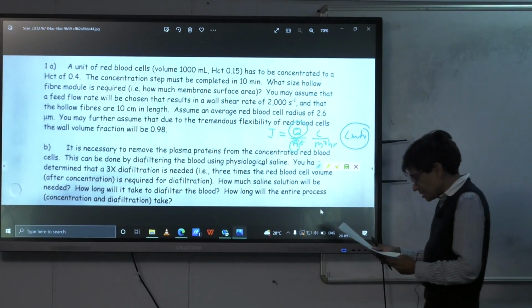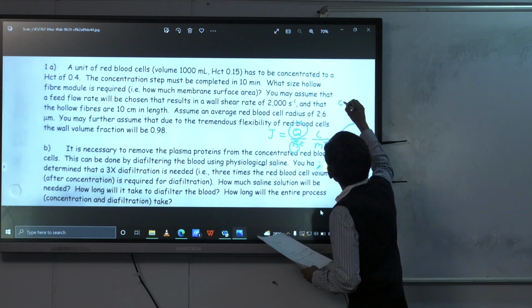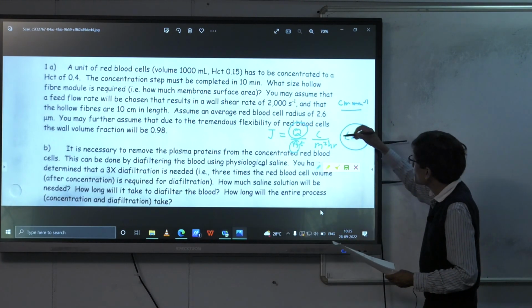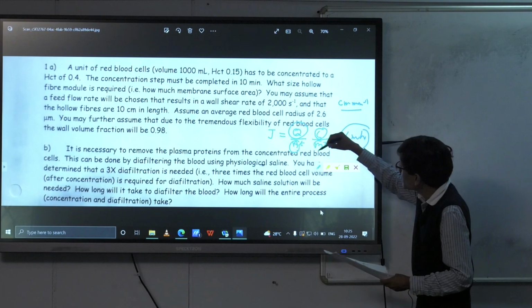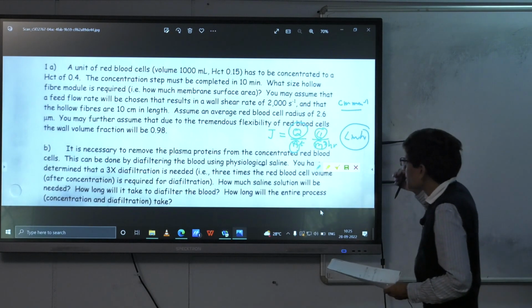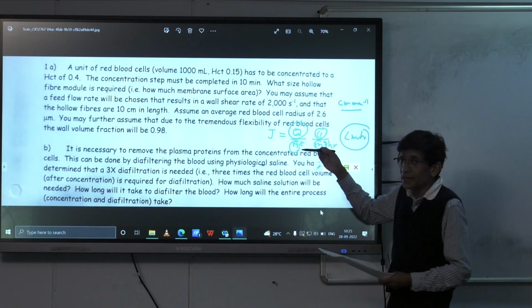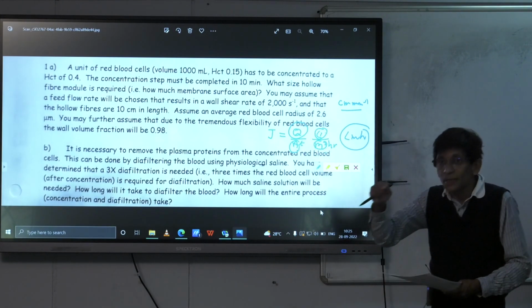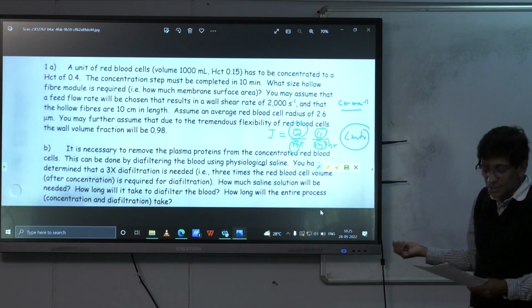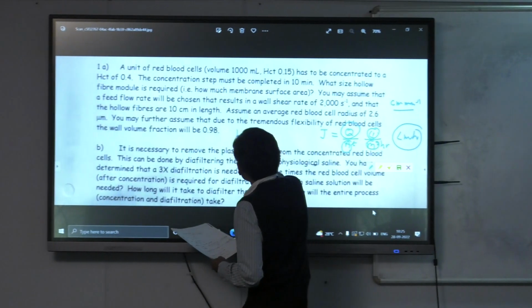So typically in these areas, we work in slightly different units, and the units are typically something like centimeters per minute. Now how does it become centimeters per minute? Well, look at this. This is actually a volume and this is an area. So actually this is just a length divided by time. From an understanding perspective, it's better to think of it in terms of volume per area time, because a flux is always your unit, whether mass or volume, per area per time. But in this case, they cancel out and you can just call it a length per time. So it's a velocity.